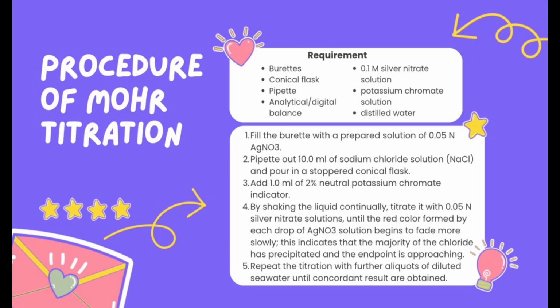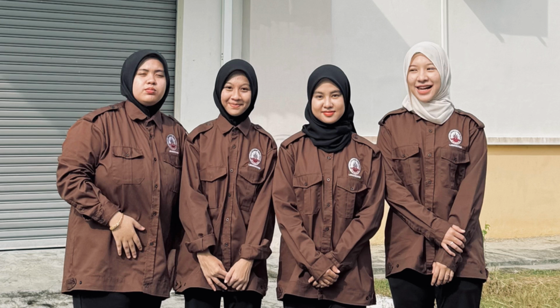Lastly, repeat the titration with further aliquots of diluted seawater until concordant results are obtained.